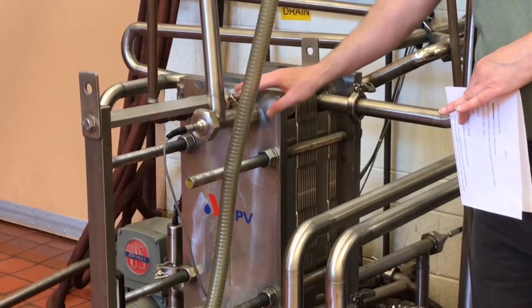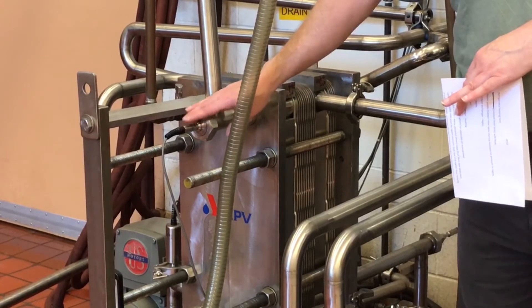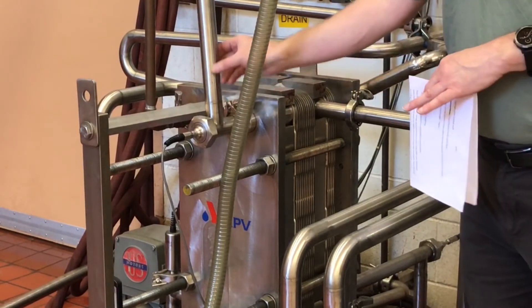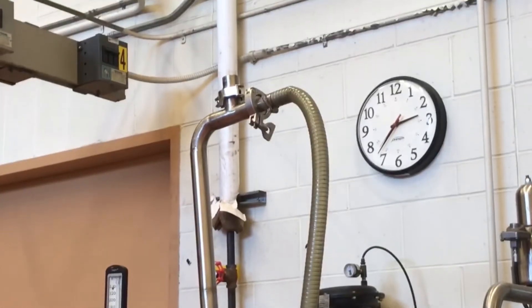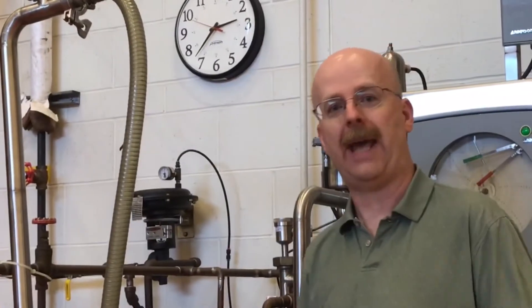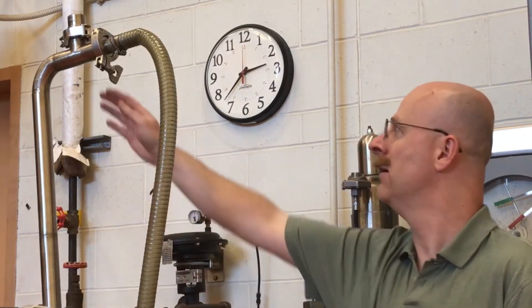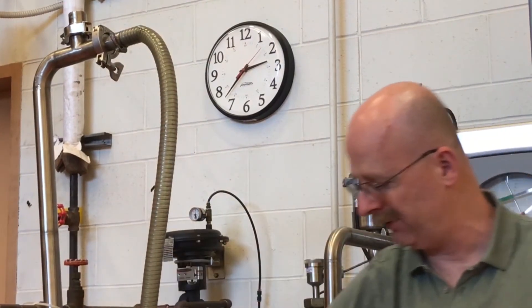Once the milk comes out of the cooling section, we record the temperature of our finished milk — we're looking at temperatures below 4 degrees Celsius. The milk then travels up this vertical pipe to our vacuum break. The vacuum breaker is basically a fail-safe device: if there is a power failure or a problem with the downstream filling equipment, the vacuum breaker will maintain positive pressure in the system. Since it's at least 12 inches above the highest raw point of the milk, due to gravity the pasteurized milk pushes down as it drains and maintains that positive pressure against the raw milk in the regeneration section.